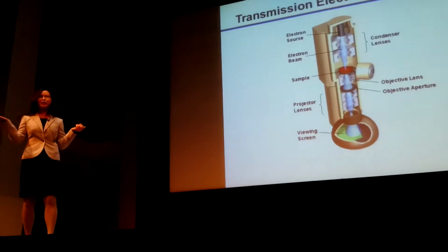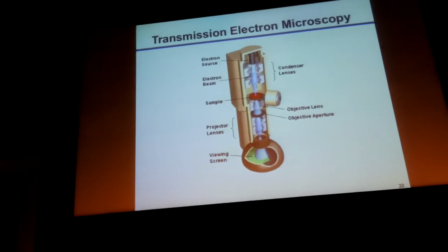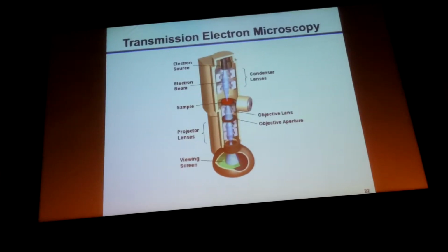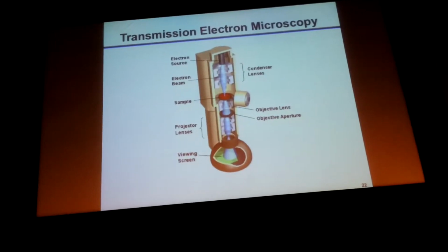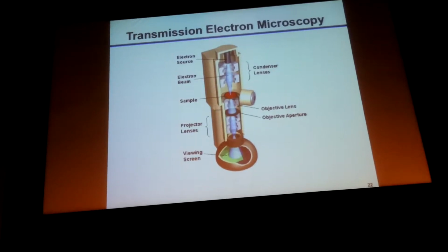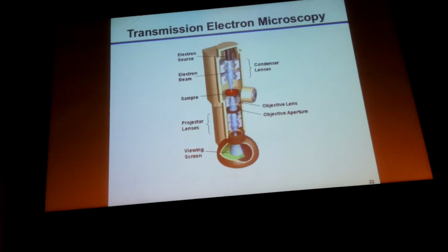In conventional imaging using a transmission electron microscope, because of the high vacuum environment, we image materials by drying them out or freezing them. Then, to understand how materials transform from one stage to another, we have to do extrapolation, just like making a guess on how the caterpillar transforms to a butterfly.